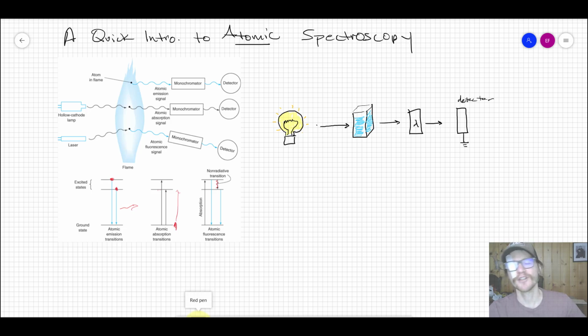We're talking about lead dissolved in something. So lead in water, or lead in oil, or lead in some sort of substance. And in order to get that lead atom into its atomic form, specifically into a gas form, we need to sublime it, and so we have to put in quite a bit of energy to get it into that gas state. So it's not interacting with other lead atoms, it's by itself in the gas, which gives us access to those really well-defined and discrete atomic orbital energy levels.